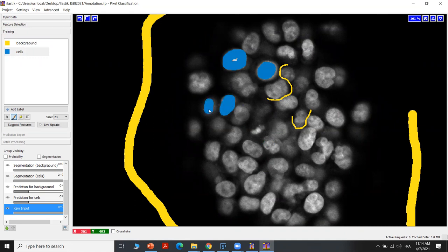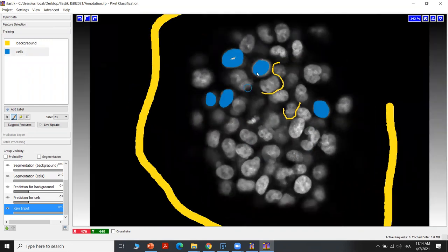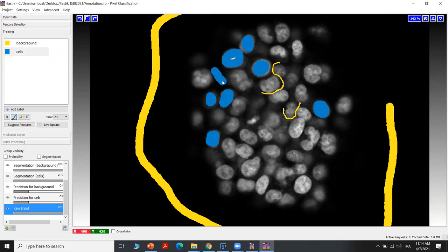We have to make sure that we are annotating all the instances that we have inside the current view. For these cells, we have to annotate all the variations of intensity that we could have inside our image. In case we make some mistakes — for example, if we annotate the background with the label of cells — we have the possibility to choose the eraser and erase the incorrect annotation.